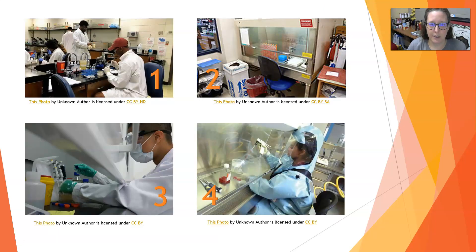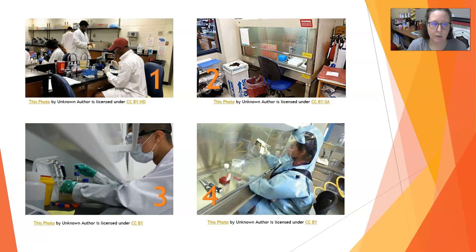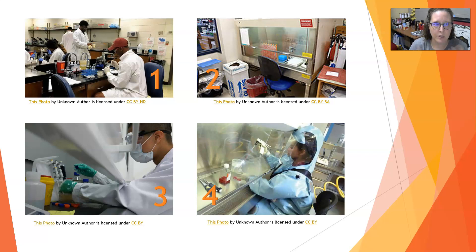Biosafety Level 1 is what you can think of as a typical student lab, and even some hospital labs. Work is done on the bench, and the microbes manipulated there are non-pathogenic or very low risk — for example, a non-pathogenic strain of E. coli. Students still need gloves, lab coats, and goggles to avoid splash risk, but biosafety cabinets are not required. Disposal in proper biohazard containers and hand washing are all that's required.